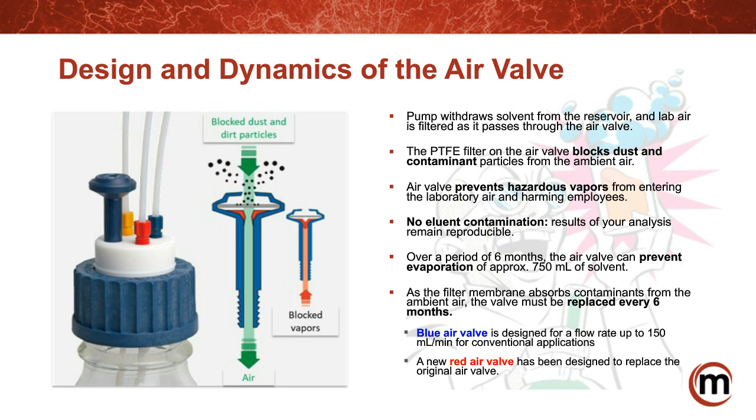We have had a redesign of these products since the image was produced. So all the filters at this point are red filters, which we'll show on the following slide.